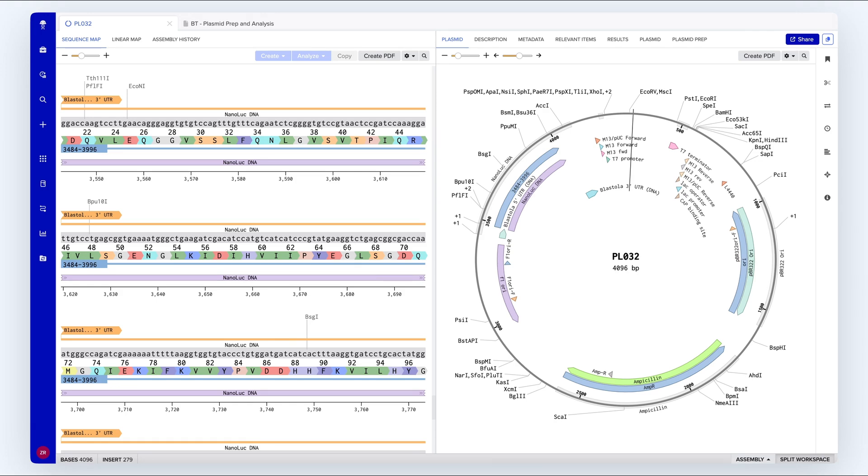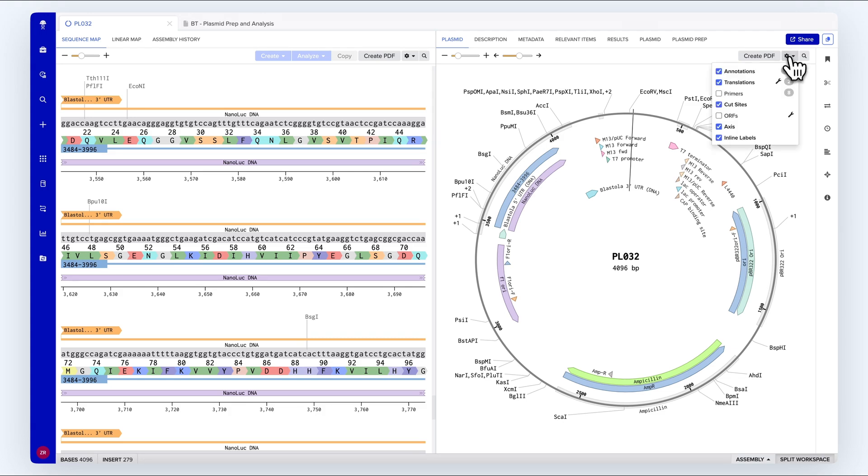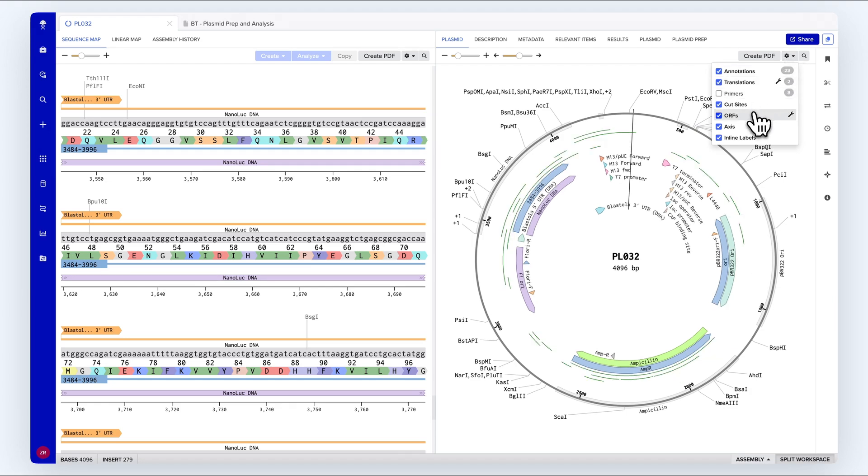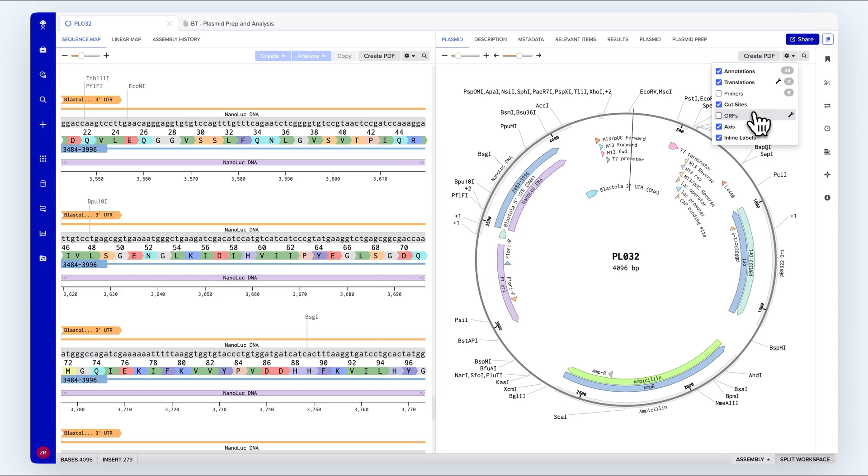Here we have a plasmid map with both a linear view on the left side and a circular view on the right side. We can customize the information displayed on these plasmid maps with annotations, primers, cut sites, translations, open reading frames, and other useful labels.